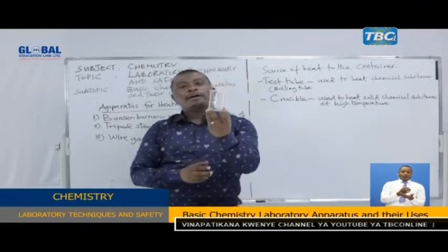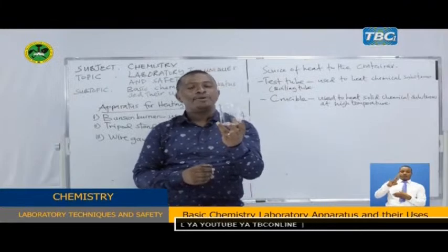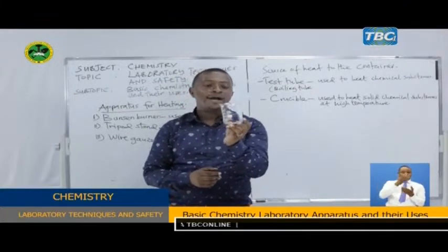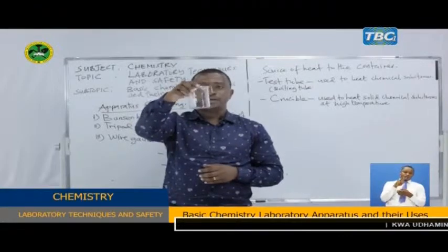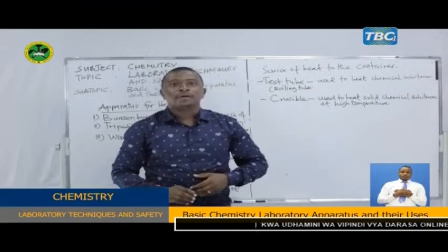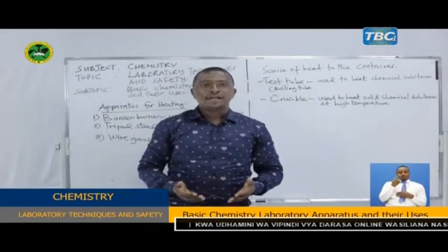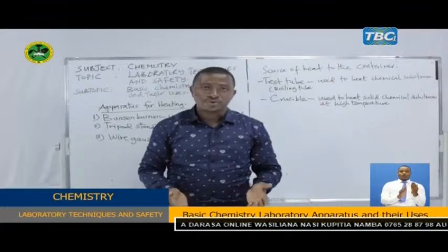This is a beaker. It can also be used for heating different chemicals within the laboratory. Beaker, it's transparent, you can see it. It is also used for heating. Now let us see a simple setup on how these apparatuses can be used.